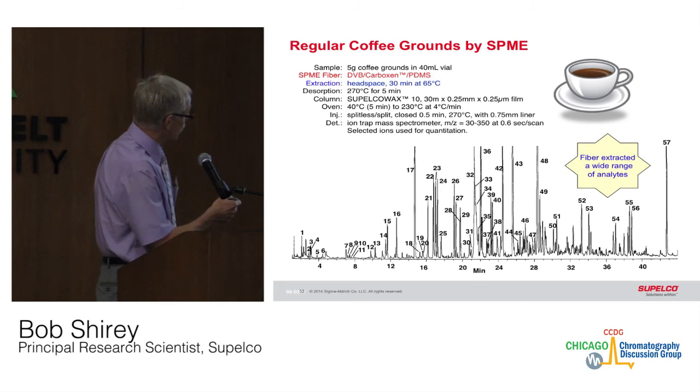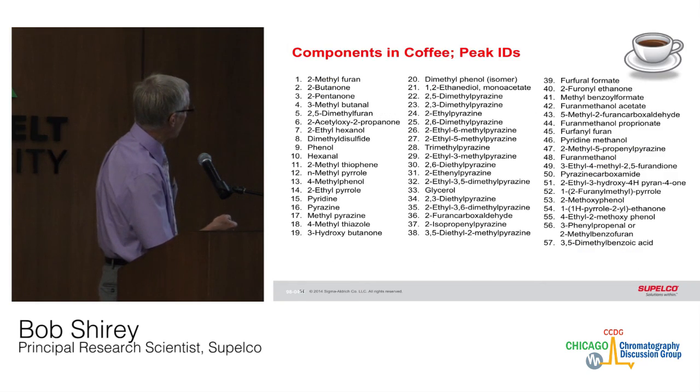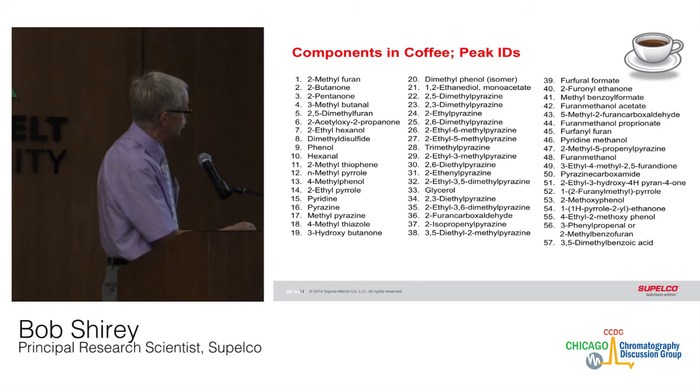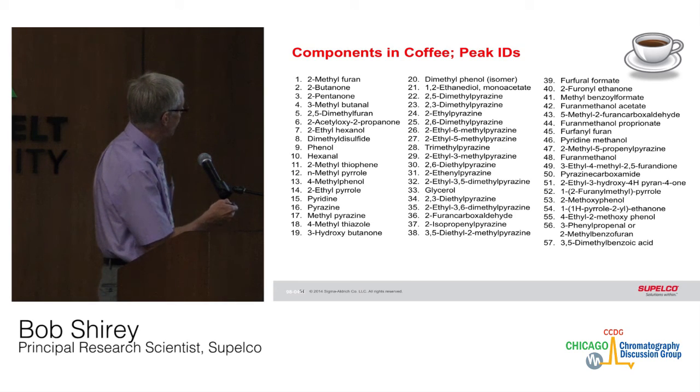This profile shows roasted coffee, and most of these compounds are pyrazines and furans. We got a bunch of interesting smaller volatile compounds that are present in coffee. And you can see there are some ketones, and you also see a little bit of hexanal and disulfides formed. But most of them are pyrazines, which occur from roasting of the coffee, reducing sugar and the amino acid.